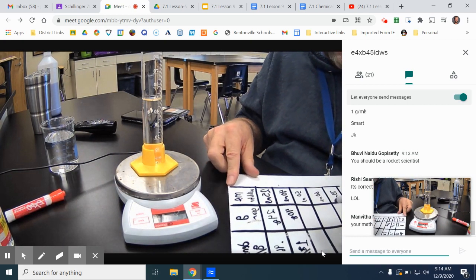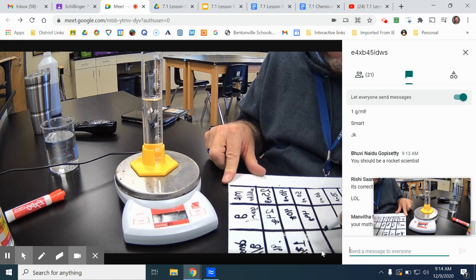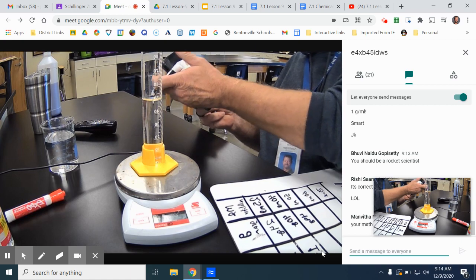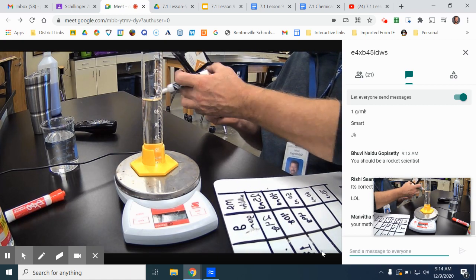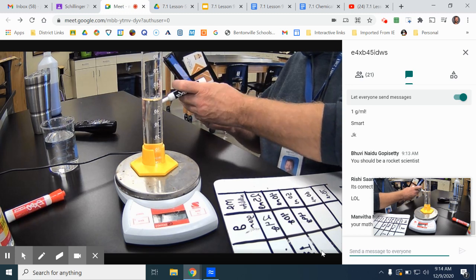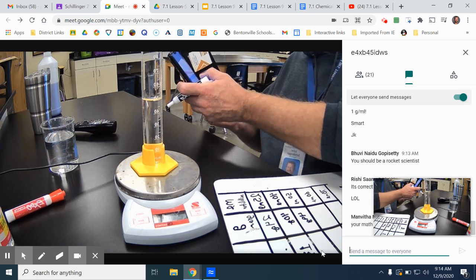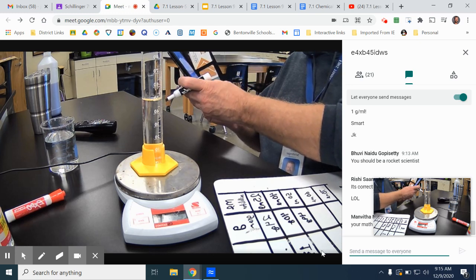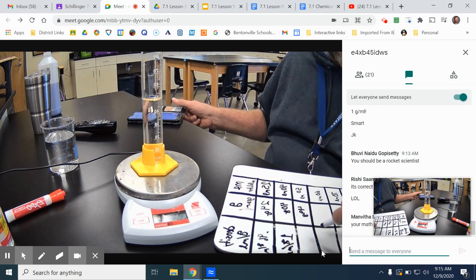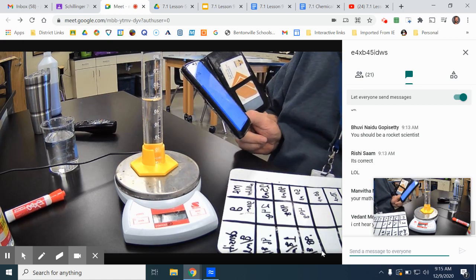And my scale comes out to 49 grams, which should be around 0.96 again. Let's see, 49 divided by 50. Oh, 0.98. Wow. I don't know. You can call Motorola and tell them their calculator's wrong if you don't believe it.